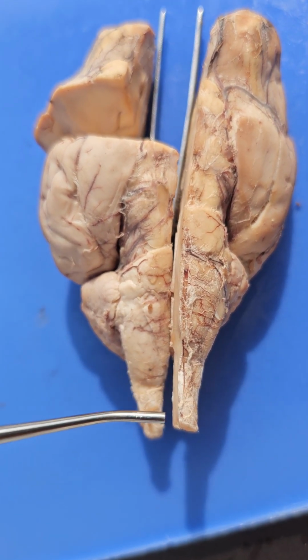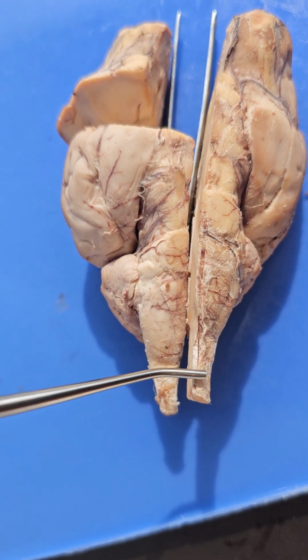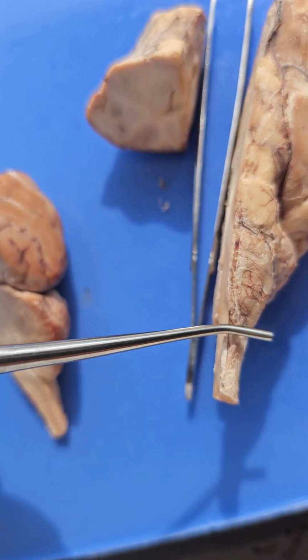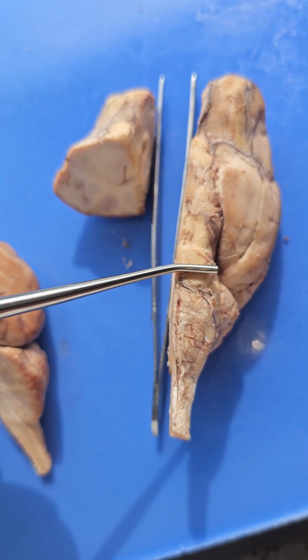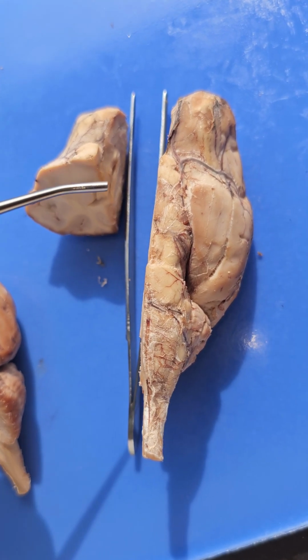Here we have the brain now, ventral side up. Starting at the back here, we have the spinal cord. Then we move into the brain stem, which is made up of the medulla, the pons, and then the midbrain. The brainstem is a connection between the spinal cord and the cerebellum and the diencephalon.